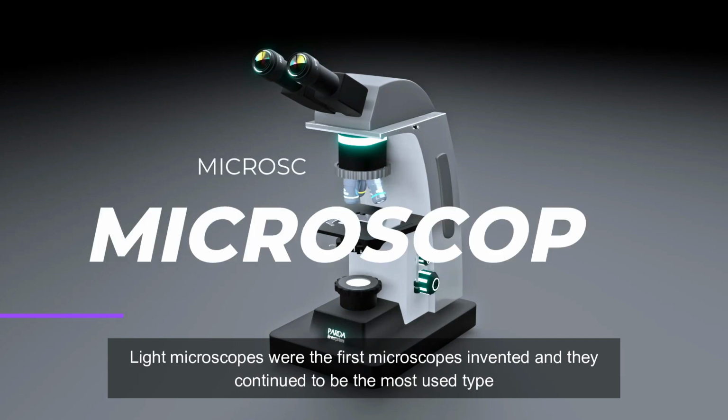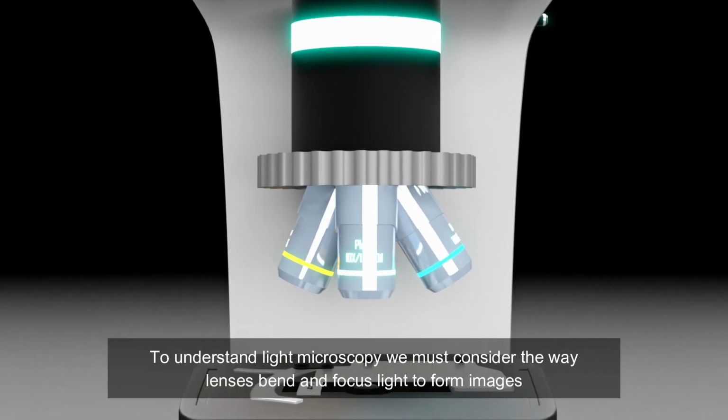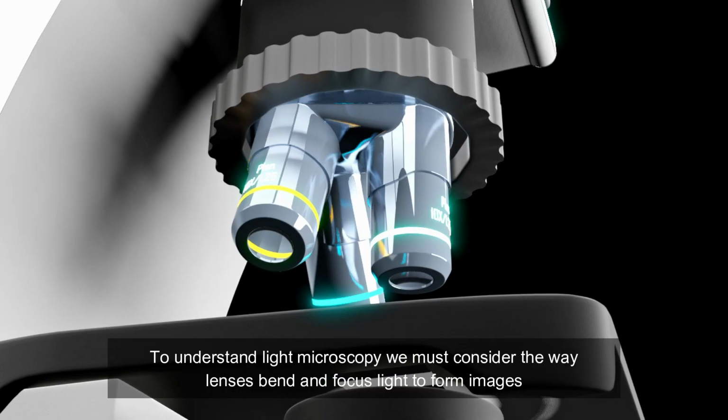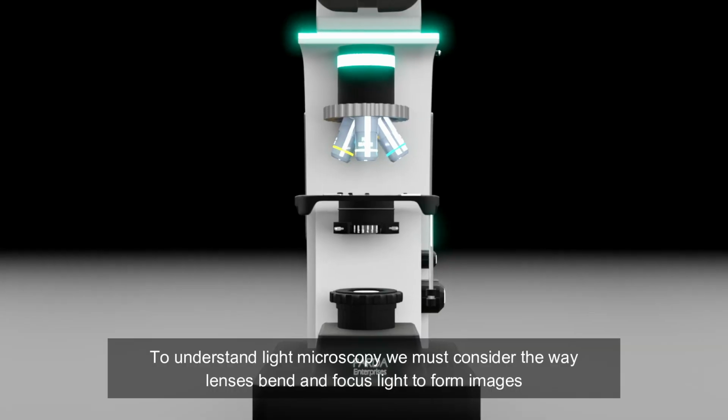Light microscopes were the first microscopes invented, and they continue to be the most used type. To understand light microscopy, we must consider the way lenses bend and focus light to form images.